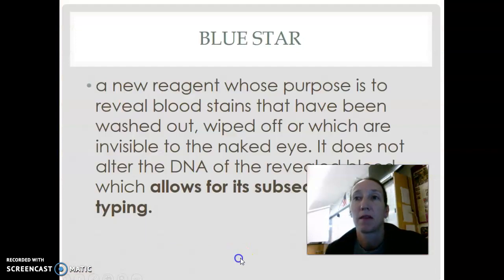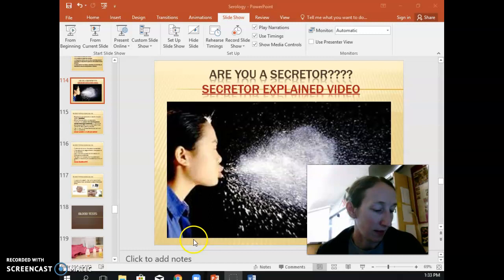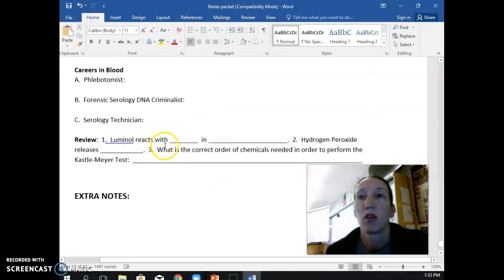All right. Now, kind of skip through this. The very last thing that I have on here is a little review. I'll pull this up for you. Luminol reacts with what? This is just back in your notes, but luminol reacts with iron in the hemoglobin. Remember, the hemoglobins are on your red blood cells, so that's what luminol reacts with. Hydrogen peroxide releases what? It's an oxidation reaction, so it releases oxygen.